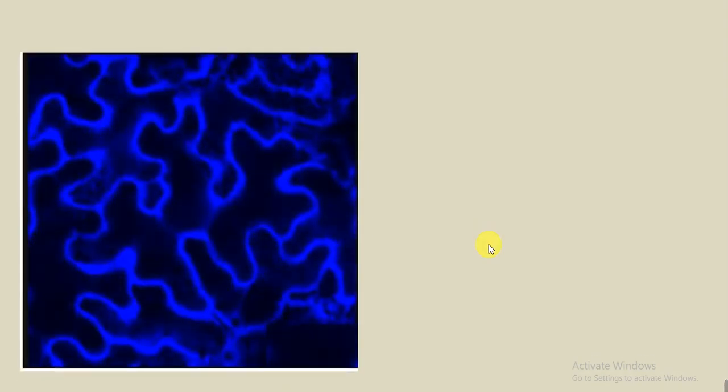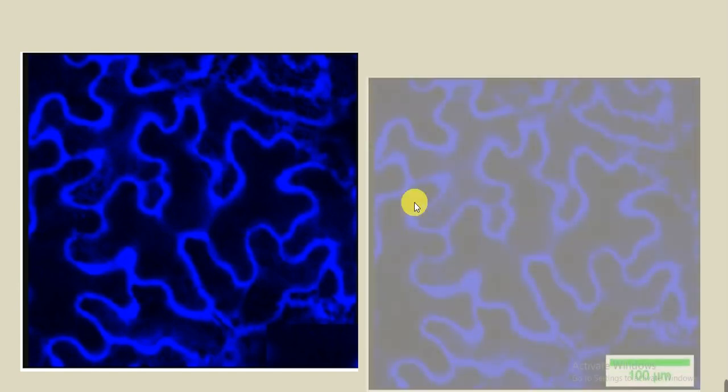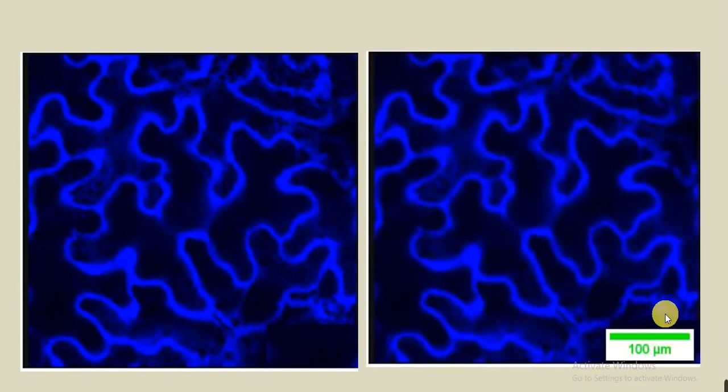Sometimes when we have an image from a confocal by doing the cell localization, or some other images from an electron microscope or any other microscope, but we didn't have the scale bar. For showing such type of images, the scale bar is very necessary. It measures the area in terms of that unit. So how can we add that type of scale bar? So let's start.